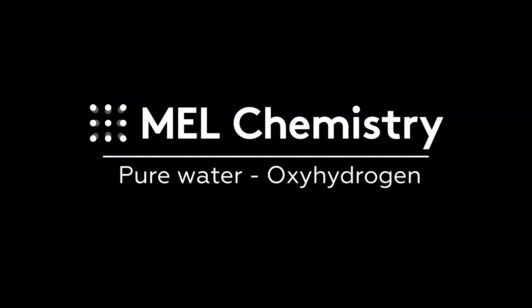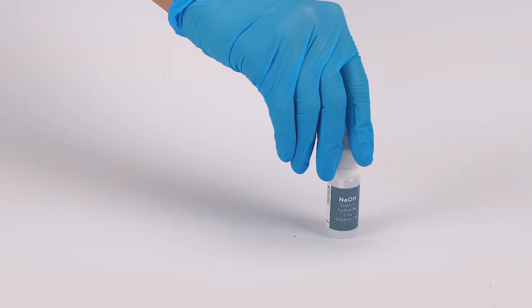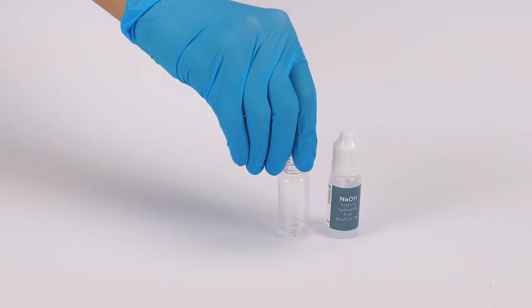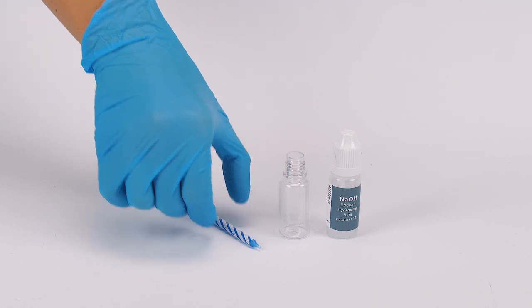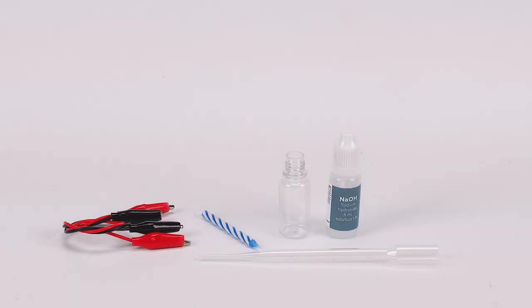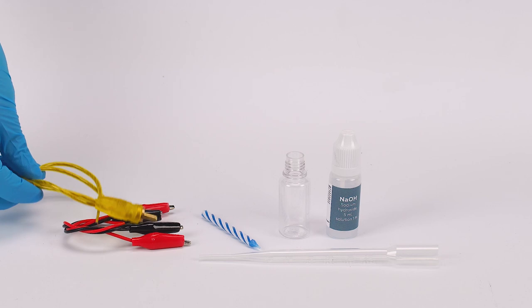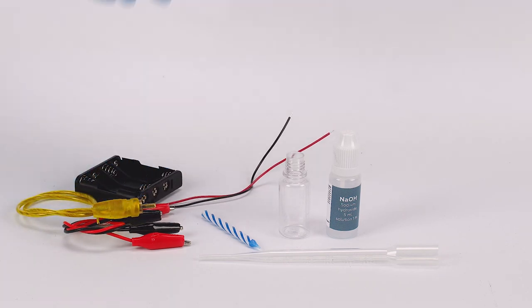For the oxyhydrogen experiment, you will need a solution of sodium hydroxide. Take an empty reagent bottle, a candle, a filter body, two wires with crocodile clips, a cable plug, and the battery holder from the experiment set.